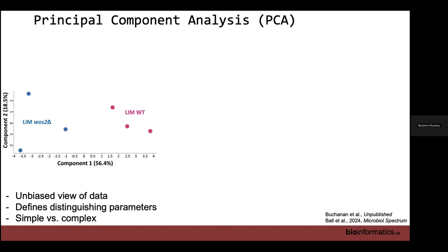No, that's right. Yeah, that covers it. And PCA is just relying on exactly that idea that your first two components are representing really the experimental driver. So you don't care about more than that. But as you have more dimensions, absolutely, you want to visualize those dimensions as well.